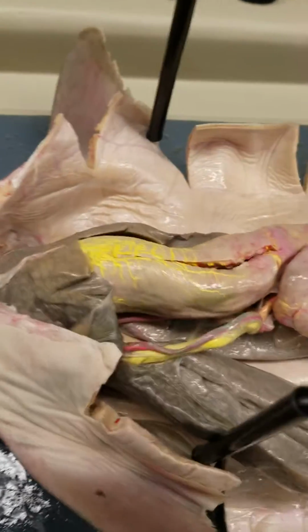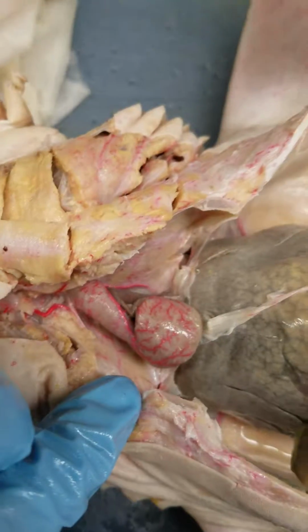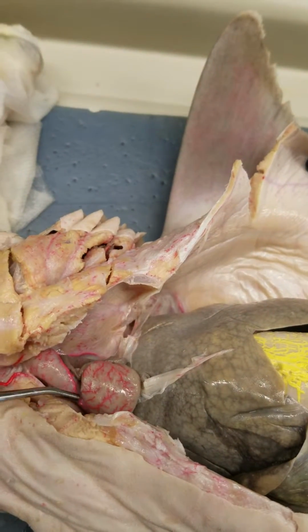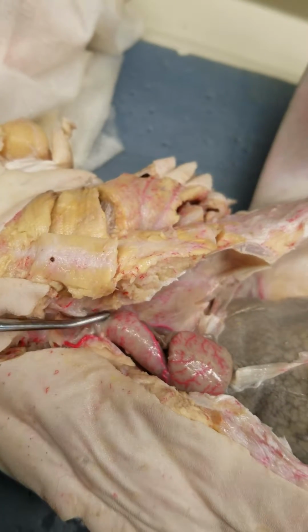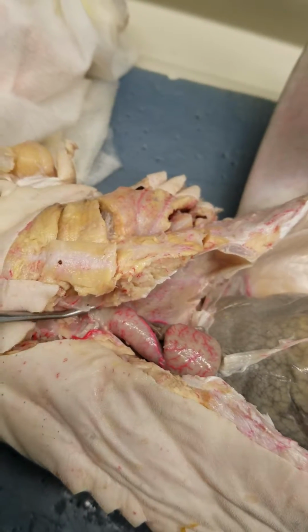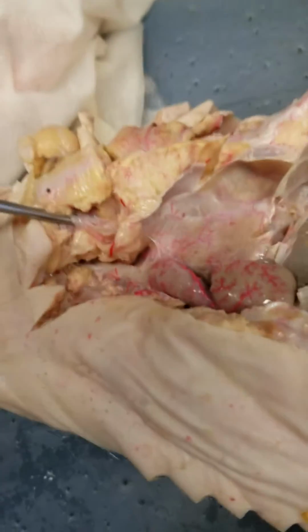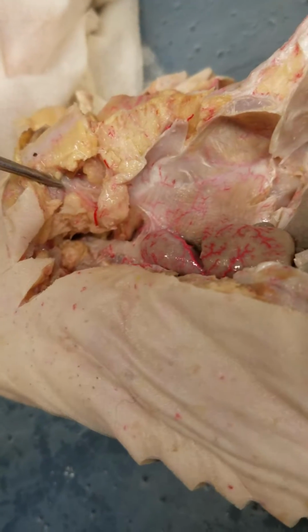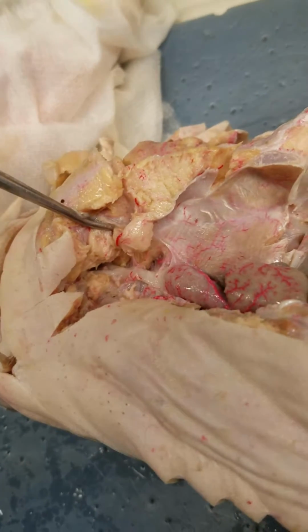Alright, so then moving up towards the head here, you can see your heart right there. So you have your atrium, which is just going to be right here, I believe. Then moving up here, you got your conus arteriosus, kind of under all this. And then up in there, you can kind of see how it branches off. And that's going to be your ventral aorta up there. There you go, you can see the branching better.